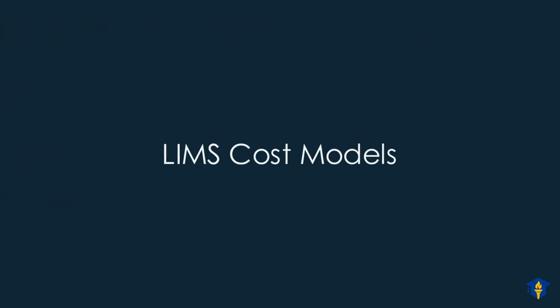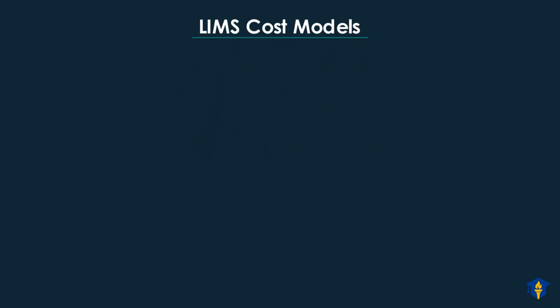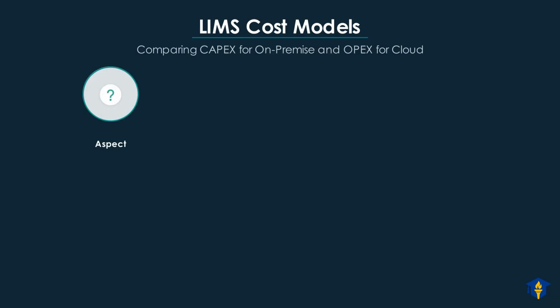We compare different LIMS cost models, focusing on capital expenditure versus operational expenditure. Specifically, we'll contrast CAPEX for on-premise solutions with OPEX for cloud-based systems. Let's examine various aspects that influence the cost and deployment of LIMS. First, consider the initial cost associated with setting up your LIMS.